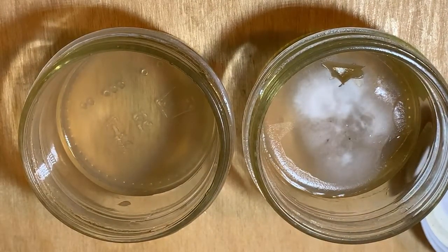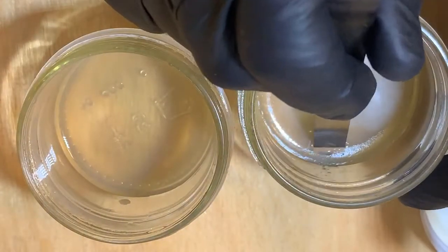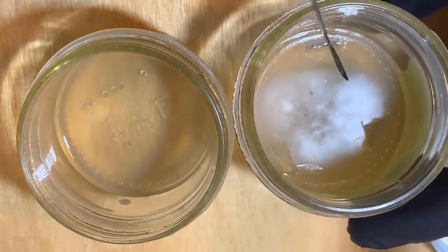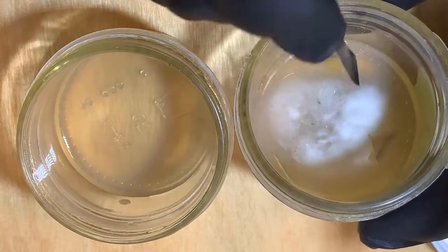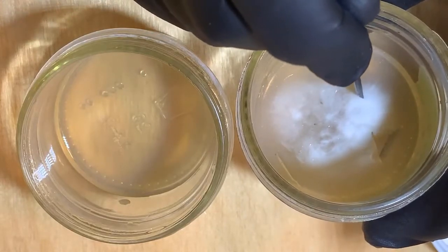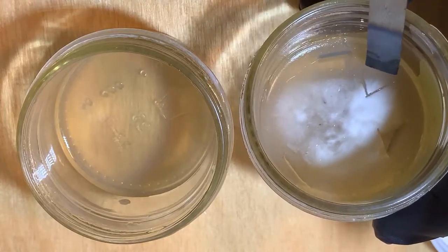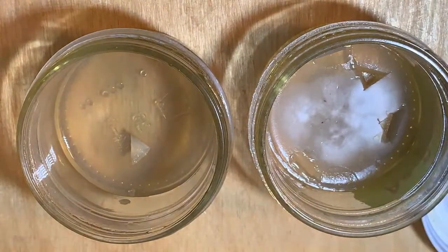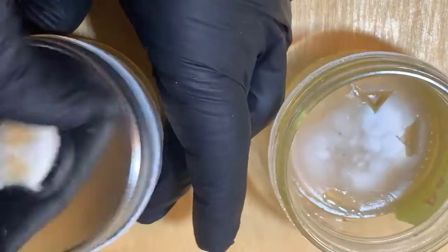I'll cool it off again and then I'll try and take another region. I kind of like the growth here — very aggressive mycelium growth. So I'll try another one from there, and we'll see what happens.